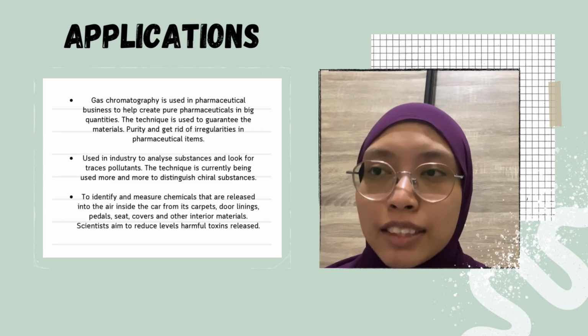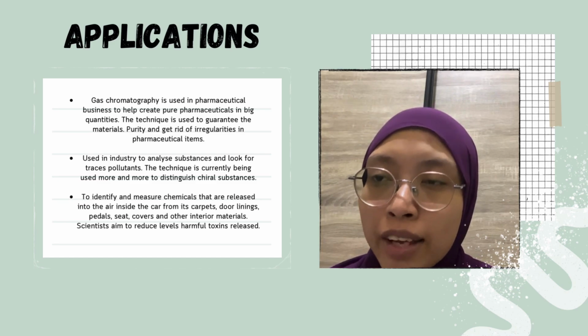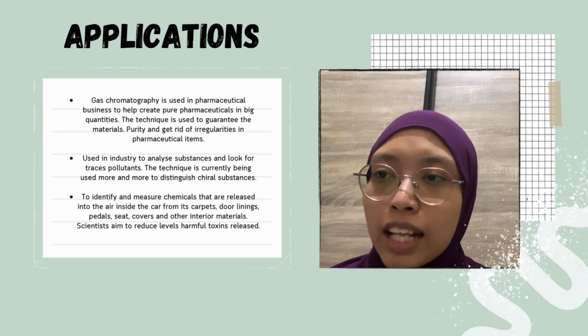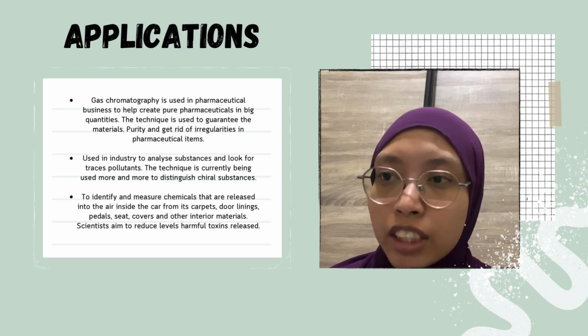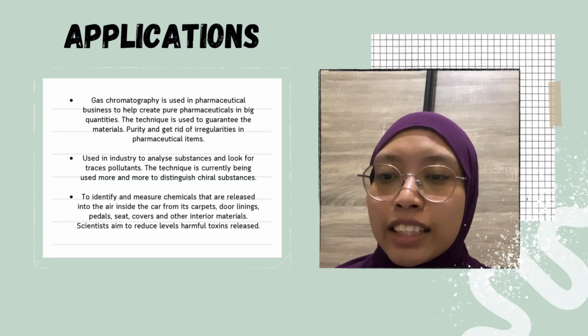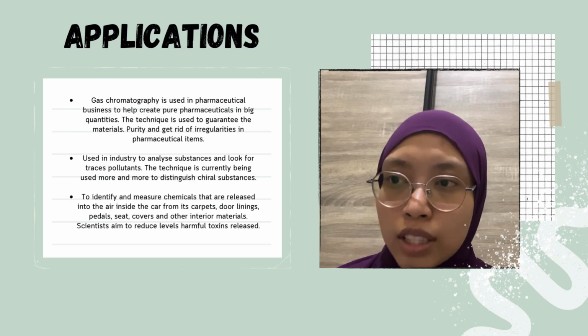This technique guarantees the materials' purity and gets rid of irregularities in pharmaceutical items such as antibiotics, injections or vaccines also. It is used in industry to analyze substances and look for traces of pollutants.